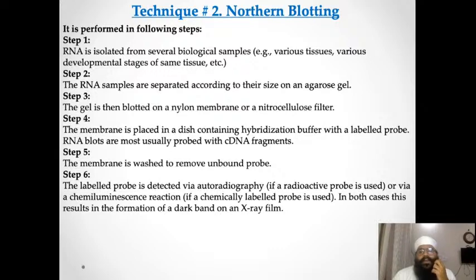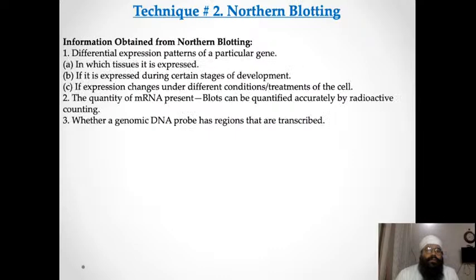Then further, hybridization is done with the buffer. RNA blots are hybridized with the cDNA fragments. The membrane is washed to remove unbound probe. Same steps that we have discussed before. The same steps are going on, then we check them with the autoradiograph.